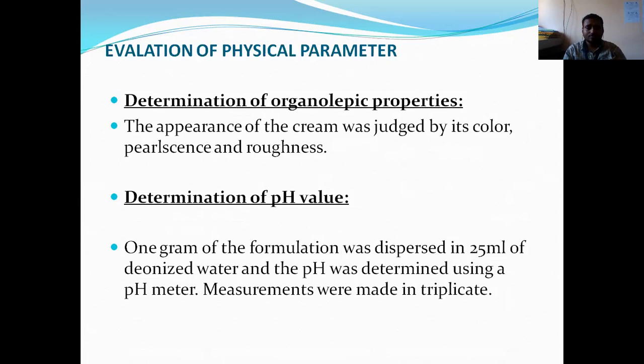Next is the determination of pH, which is measured with the help of a pH meter.